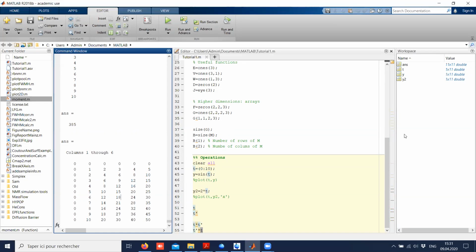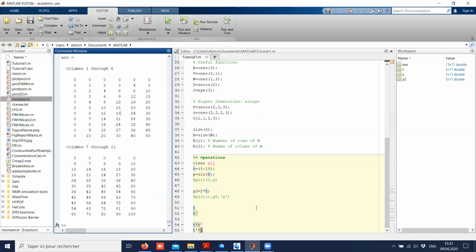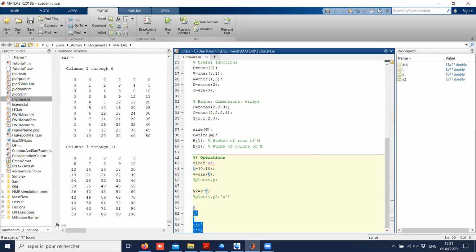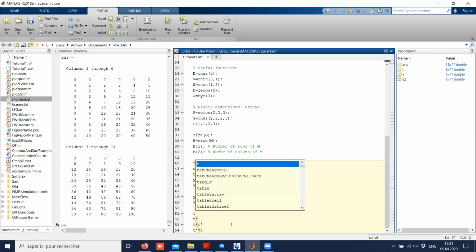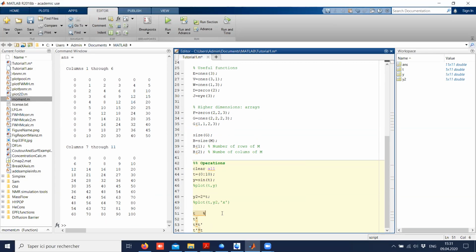So this is basically linear algebra, and it's not very convenient to explain how it works on this Matlab screen. But I'm not going to use that too much in the presentation. I just write here. So this is, we said, a column, a row vector.